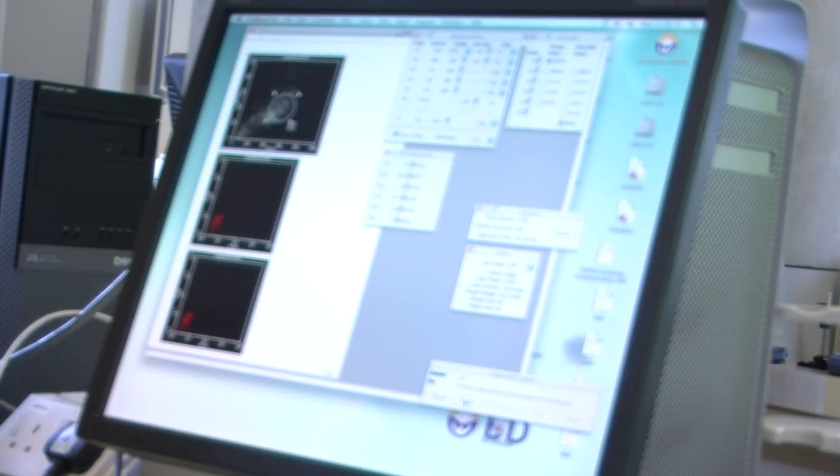But also bear in mind that different cells will behave differently when you label them. So some cells, there's one cell I call QVEC that I used to use, a lung cell line. Even if you centrifuge it on the lowest settings, these cells just fall apart. Have you ever used QVEC? They're awful. Basically, you pick up the flask and half of them have died. You know, they're so fragile.